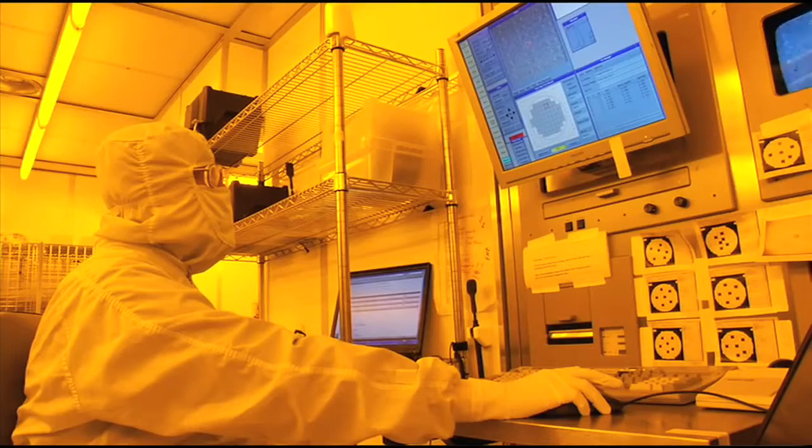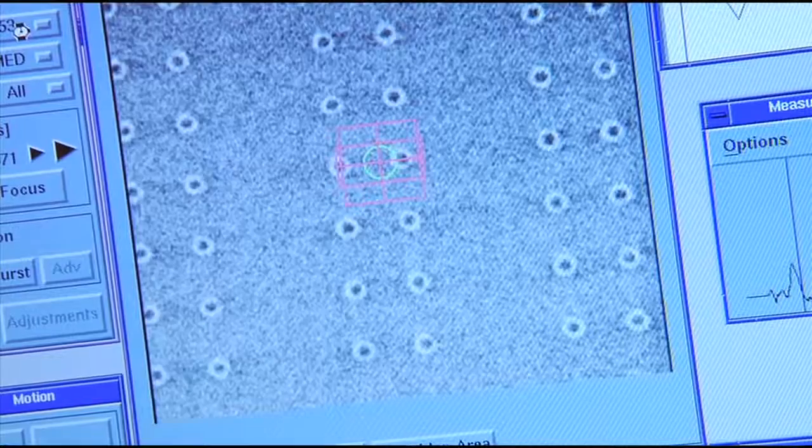What we are trying to do with the DNA transistor is to sequence DNA. We want to control the passage of DNA through a pore. This nanopore will allow a single DNA molecule to thread through this nanohole. This device, formed by a pore and a few tiny electrodes, allows us to make a DNA go through this little pore and be trapped by the electric field created in these electrodes.